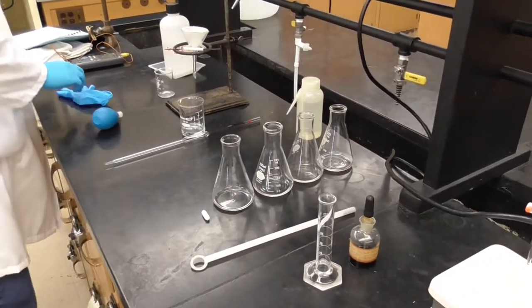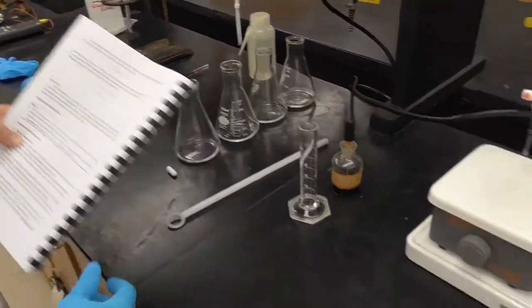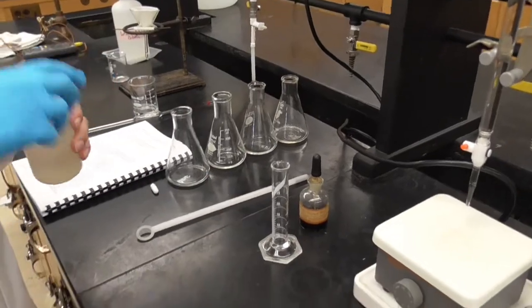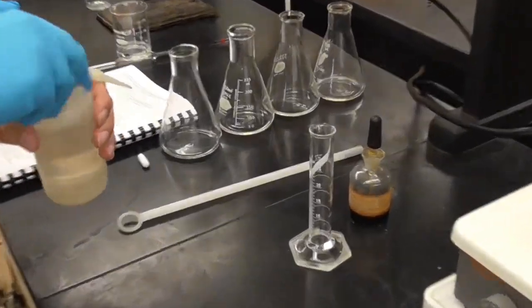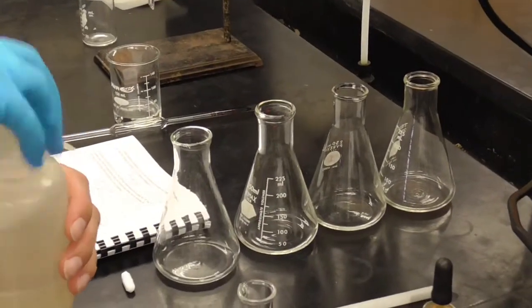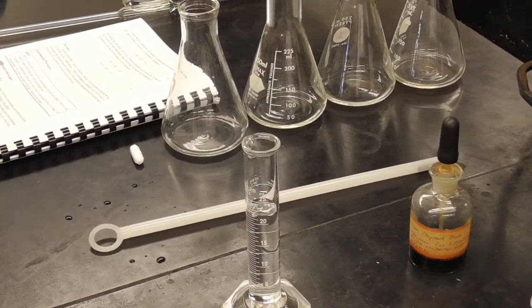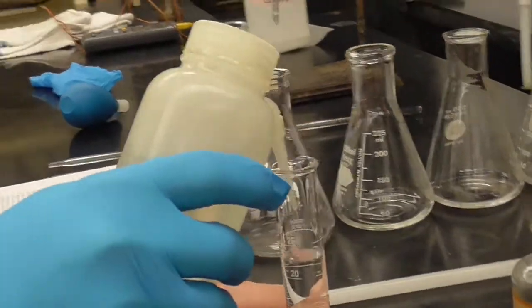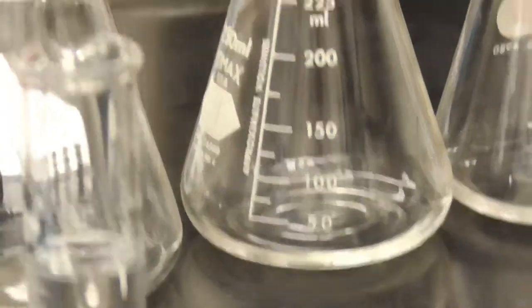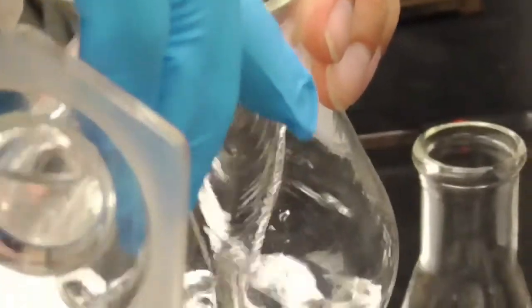And then we are now down to step 5. It says add 25 mL of deionized water and a few drops of bromothymol blue indicator. So here's our graduated cylinder. We're going to put 25 milliliters in there. It doesn't have to be an exact amount, but we're going to get reasonably close to 25. We're going to add that into the first sample.